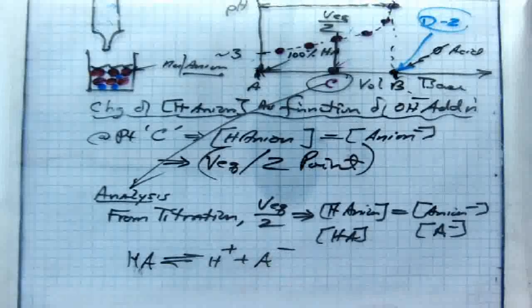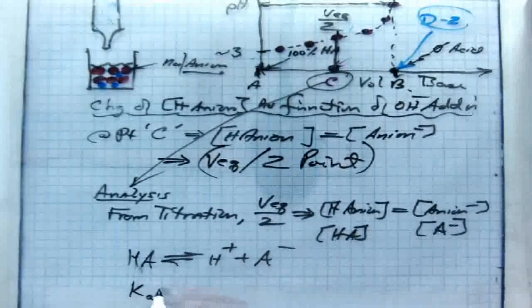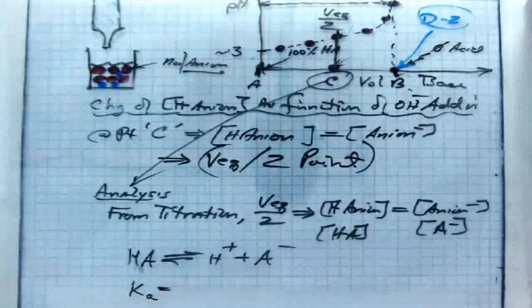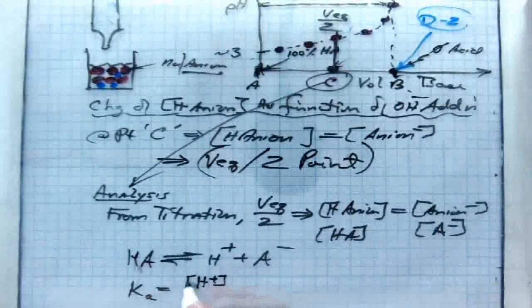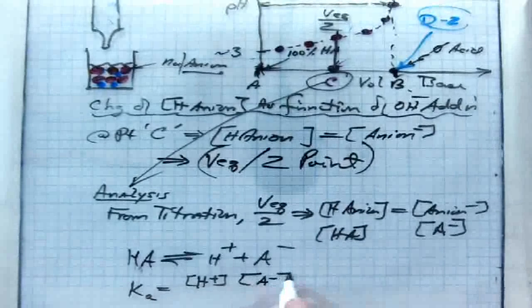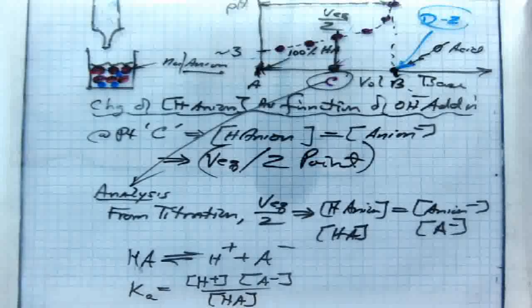However, in your titration curve, let me draw it one more time. You do not measure directly the hydronium ion. What you're measuring is pH values.